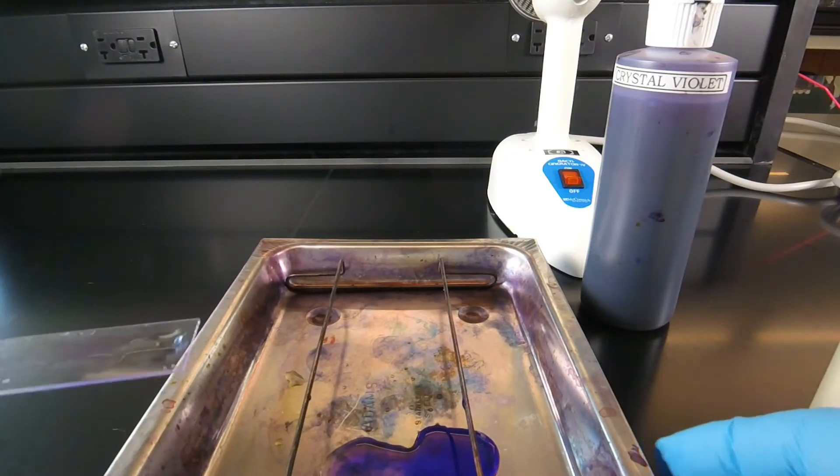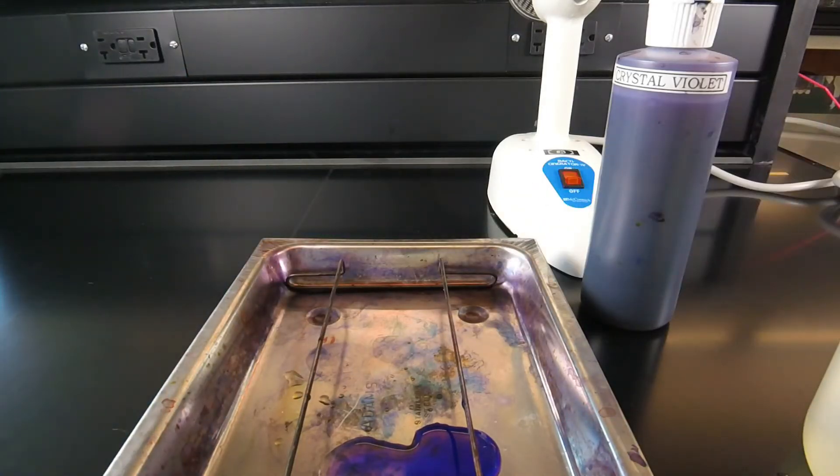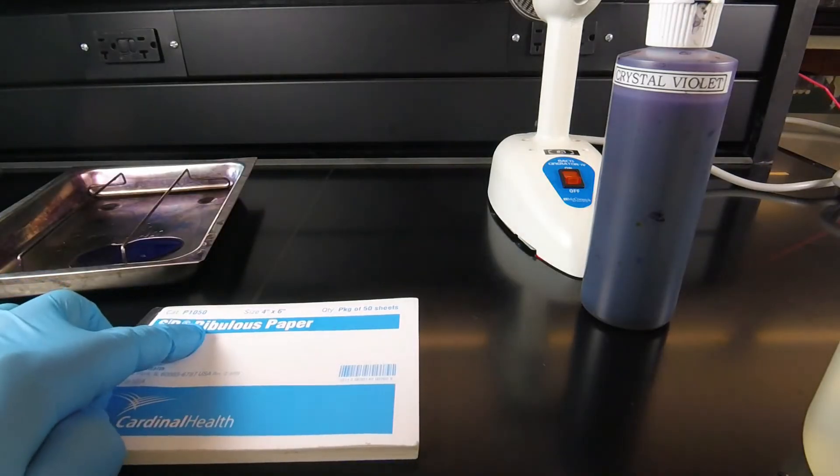Now once we've washed off the excess dye, we're going to blot the slide dry. To blot the slide dry, we use books of what's called bibulous paper or blotting paper.